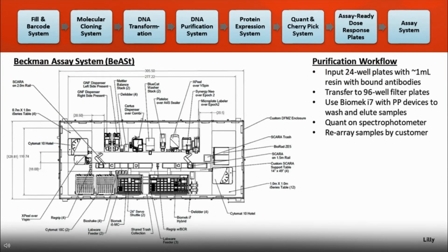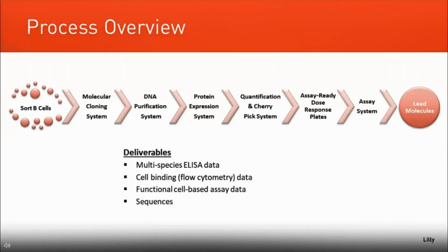So from here, we will measure the amount of material and then break the plates out and give people plate maps of their purified material. And so again, putting a few bioshakes on another system and a couple positive pressure devices on this guy, and using all the other equipment that we already have in place, really is a little bit of equipment to enable a whole other automated process that we weren't doing previously.